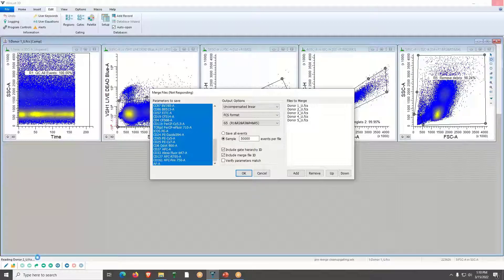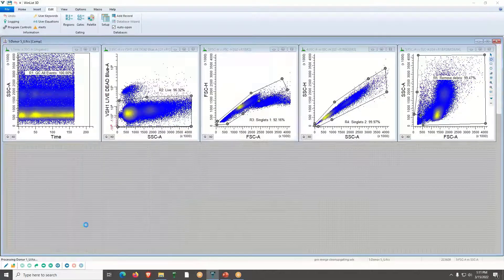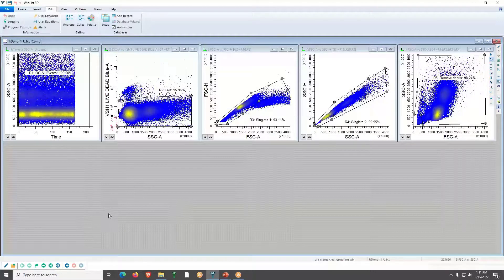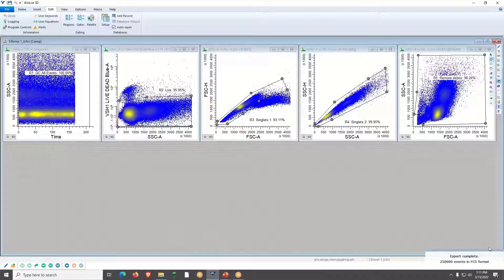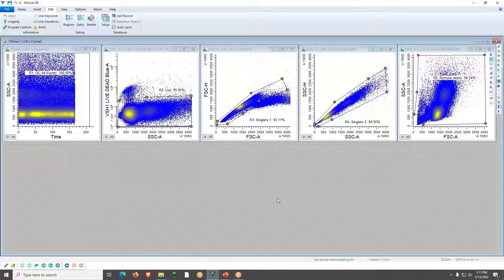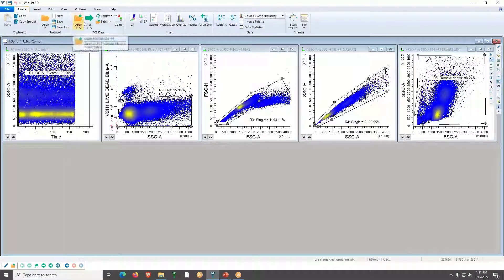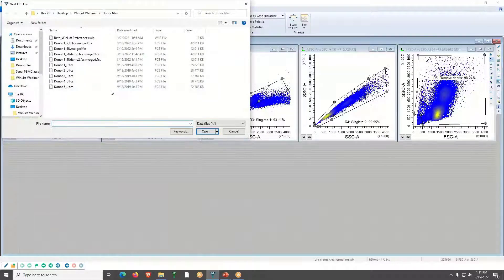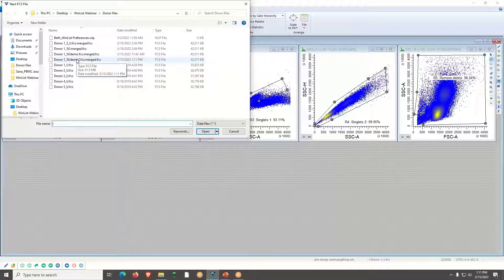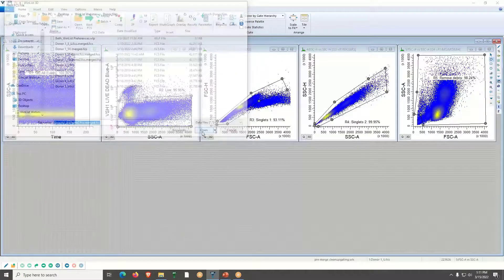You can see it reading the different donor files, and also track progress in the upper area. Then you get a toast message in the lower right saying 'Export Complete' with 250,000 events in the data file. The next step is to open that merged file — go to the Home tab and click Next FCS File. It will bring up the window where the data file has been saved.